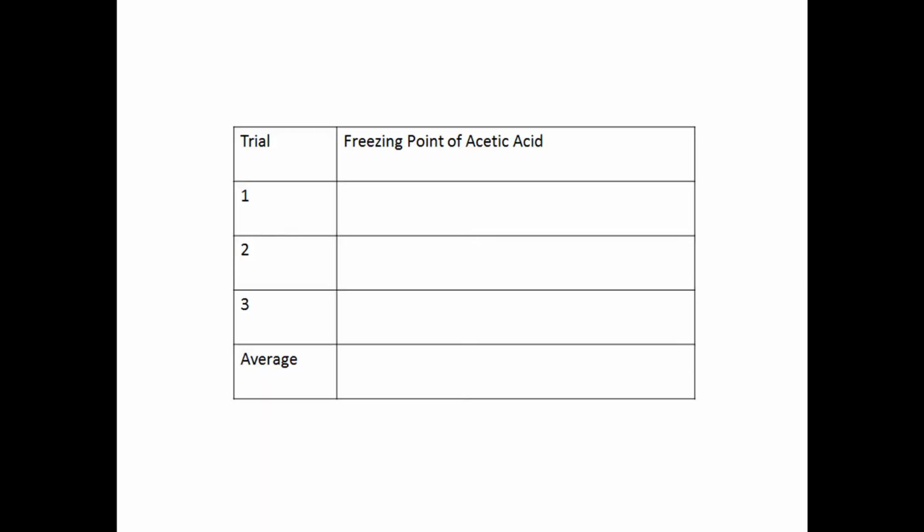Next, we will conduct 3 trials to find the freezing point of acetic acid. After all 3 trials are completed, you will have to find the average.